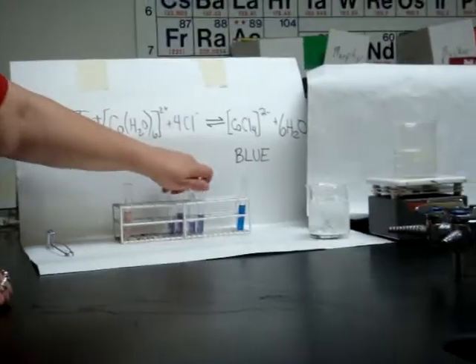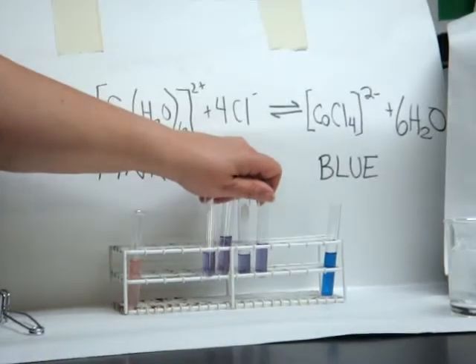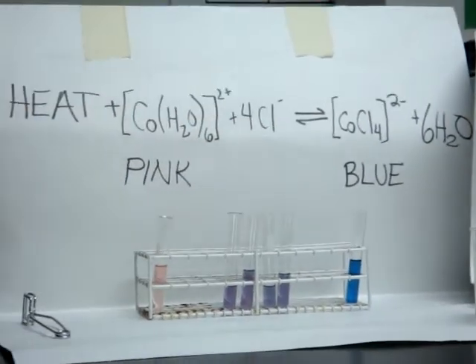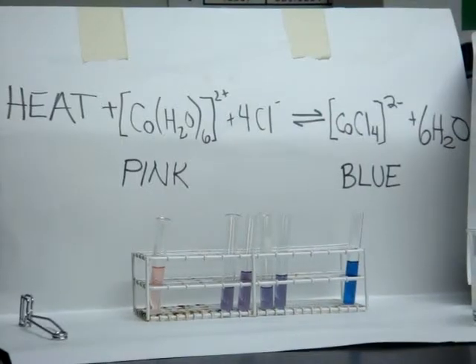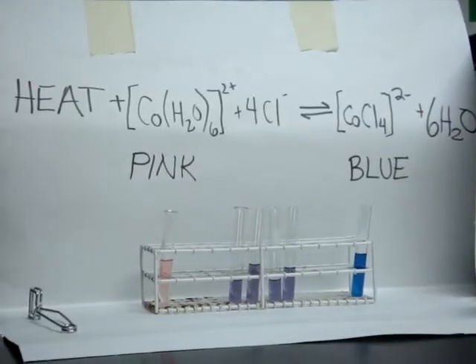Now in the middle here I have four test tubes that are sort of right at equilibrium. They're purple so they're halfway between, and I'm going to add a stress and I want you guys to predict what's going to happen. Will it shift to the left and be pink or will it shift to the right and be blue?